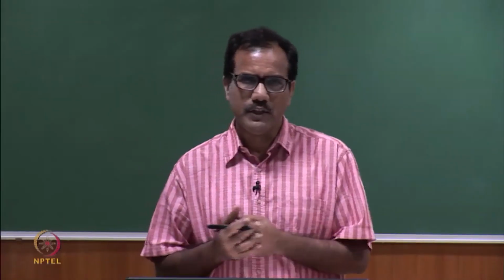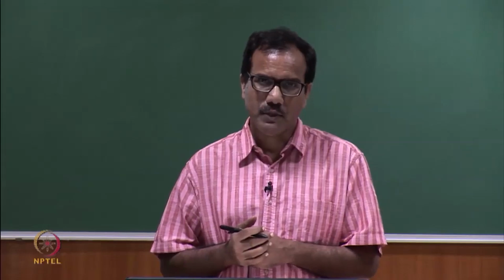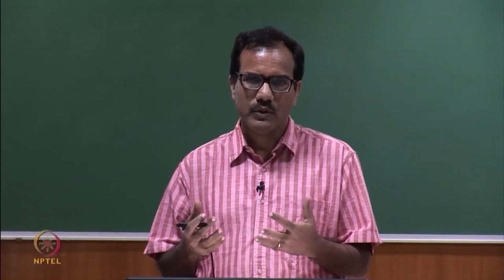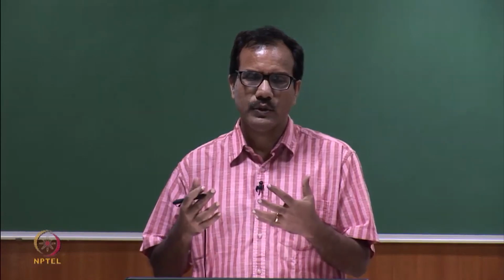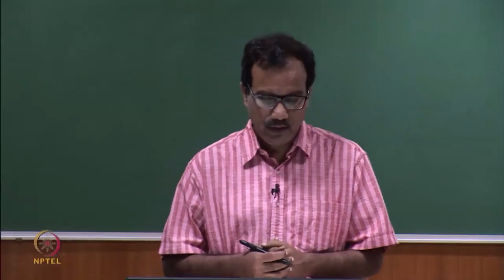Now, there are some very important facts about lifetime which you should know. Lifetime is an intrinsic property of a fluorophore and therefore does not depend on the method of measurement. So, this is a very important property, and that gives you a tool to use this property in different kinds of applications.